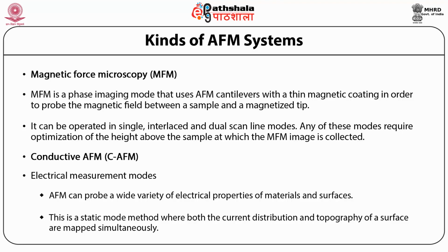However, the advantage of CAFM, which uses a conductive cantilever as opposed to a sharp metallic wire, is that it provides topography information and current information independently. Single point measurements that measure the current versus voltage curves can also be collected in this mode to probe the detailed electrical properties at a position.